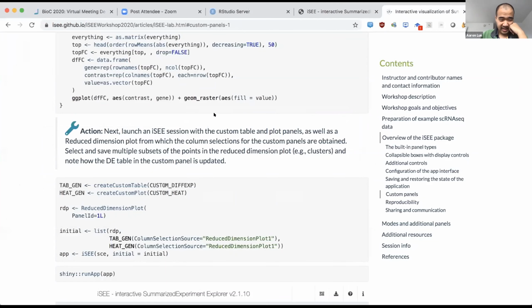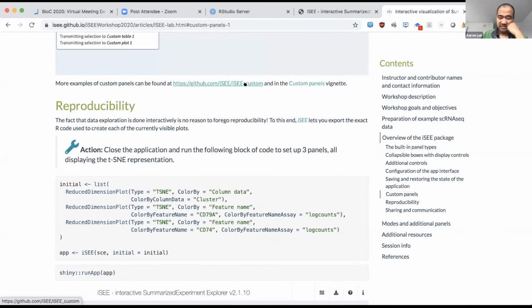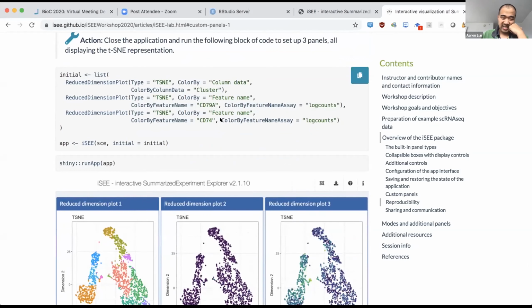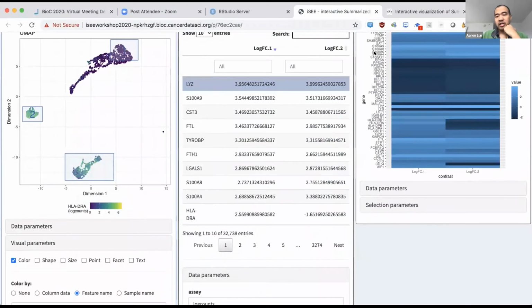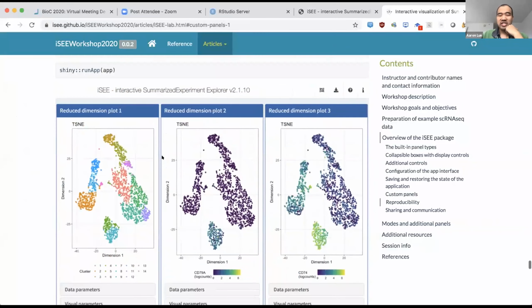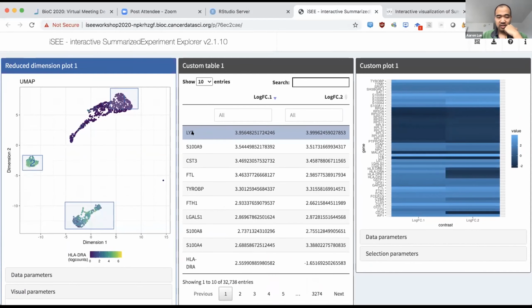I don't know if I had anything else to talk about. Reproducibility, I think someone already mentioned that. I think Fed already covered that a bit, but yeah. It's pretty cool, right? You can just reproduce the state exactly as it was before. And usually when I try to do this, I don't write it all from scratch, especially if you have brushes. If you want, you can exactly reproduce the brushes as they're shown here.